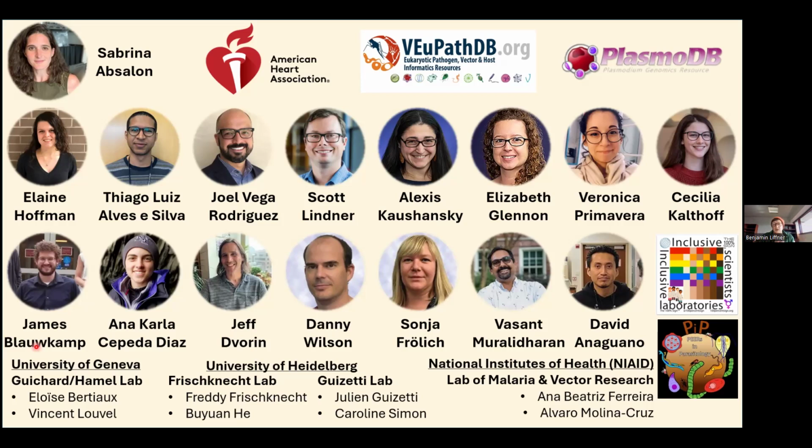I think also for tissues that are traditionally difficult to optically clear, just the SDS step of expansion microscopy is not enough to clear the tissue so that you lose all the tissue autofluorescence. If you were working on those kinds of tissues, kidney or liver for example, you probably have to do some sort of combination of clearing and expansion to get that to work. But in general, if your section is thin enough, this becomes a non-issue. We've expanded brain slices before, and it was not a problem so long as they were thin enough. So I think it's a lot about penetration of that gel.